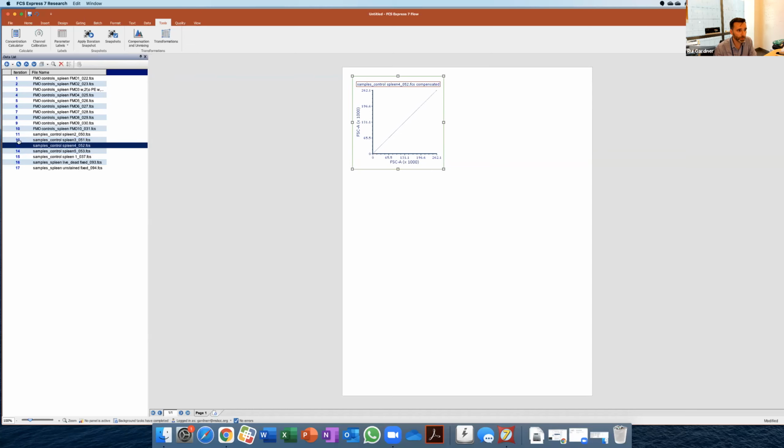If we click here, we can change from sample to sample, right? It will refresh the data. I'm going to start with the live dead, but notice that during acquisition, unfortunately, there weren't any labels. The person that acquired this didn't write the labels, and so we only have the fluorochrome list, or the name of the channel.